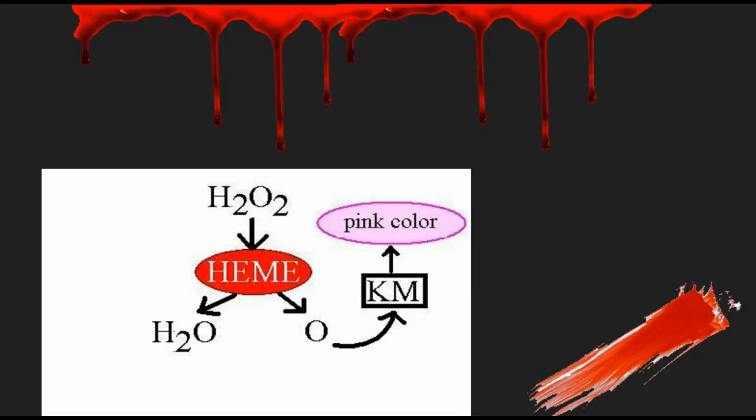The ethanol, or the ETOH, that's going to help us break open the red blood cells. And we have to break open the red blood cells to get the rest of the test to happen. Once the ethanol breaks open the red blood cells, it exposes this right here, the hemoglobin. Hemoglobin is part of the things that makes our blood red. It's what holds on to the oxygen and the carbon dioxide. It's very rich in iron.